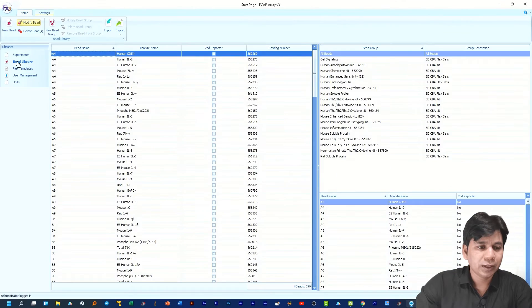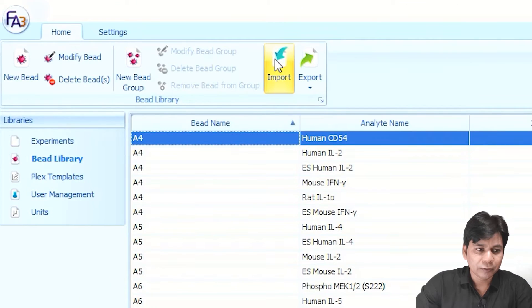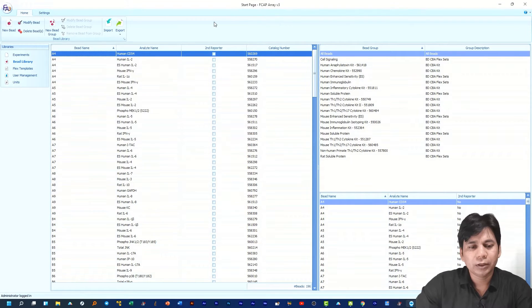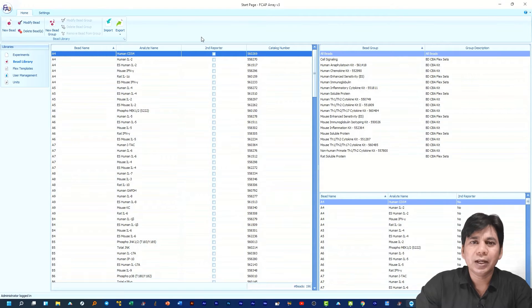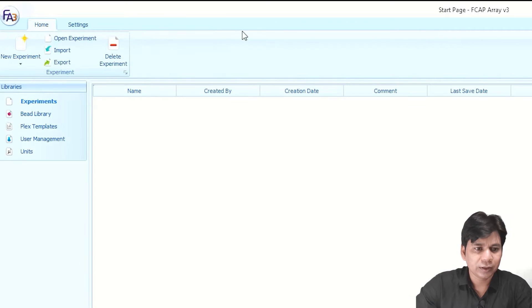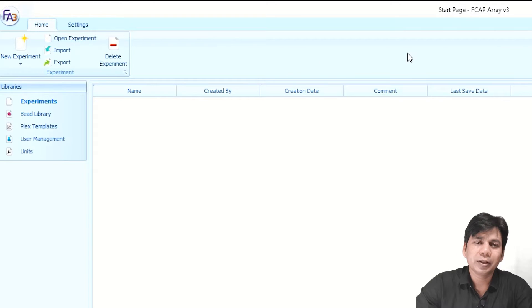In the FCAP Array software you can import by clicking 'Import.' If you click on Import you can open the downloaded bead library. I have already done this so I cancelled here. Before importing, you have to unzip the bead library. Here I am selecting 'Experiment' — you can see the interface of FCAP Array.